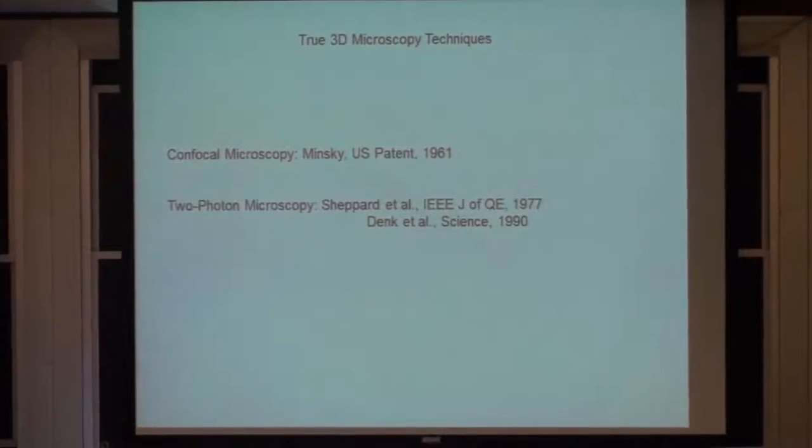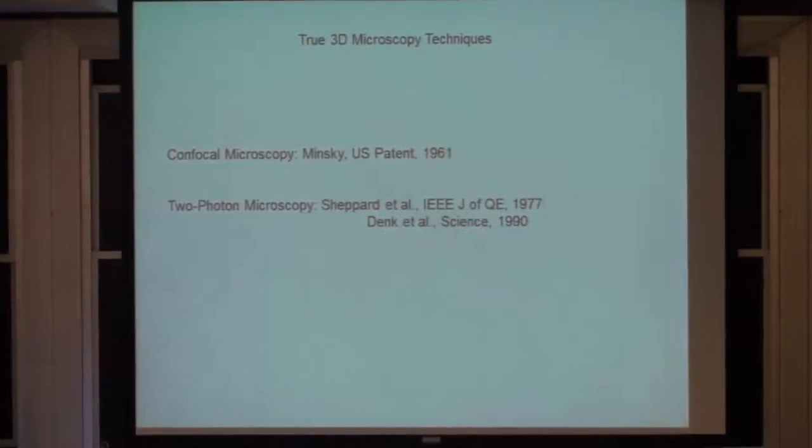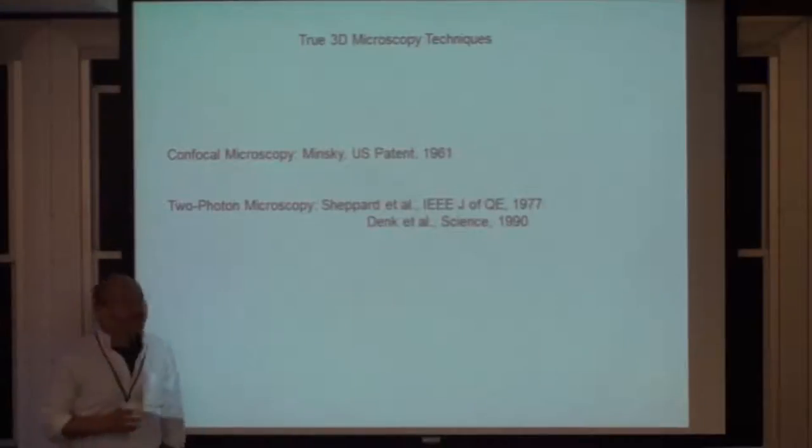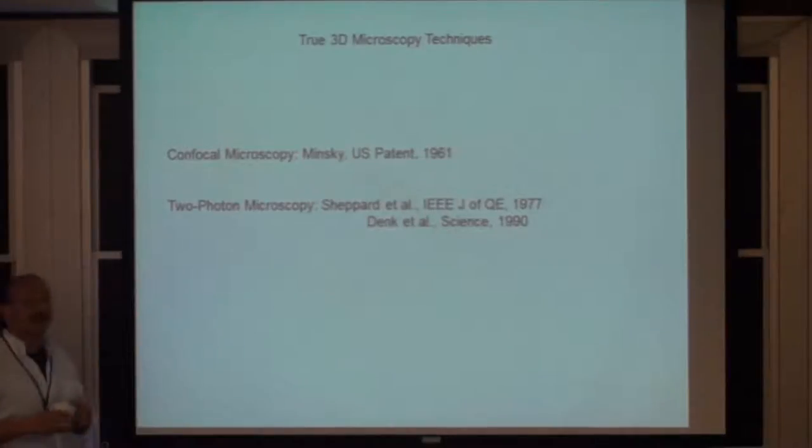So the trick is, can one develop a method that is 3D resolved so that you can extract information on a plane-by-plane basis? Okay, so there are two quite traditional methods today. One of them is confocal microscopy, first developed by Professor Minsky, also from MIT here. The second method is two-photon microscopy, developed by two groups. I will mention that also in a minute.